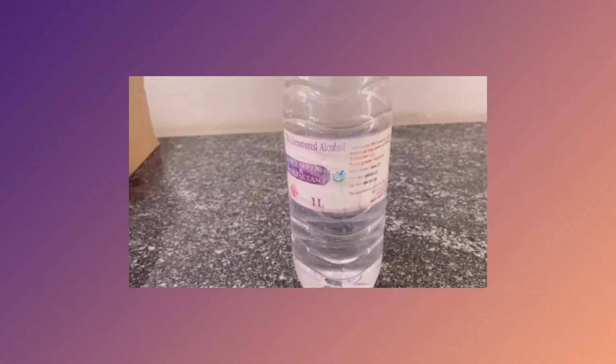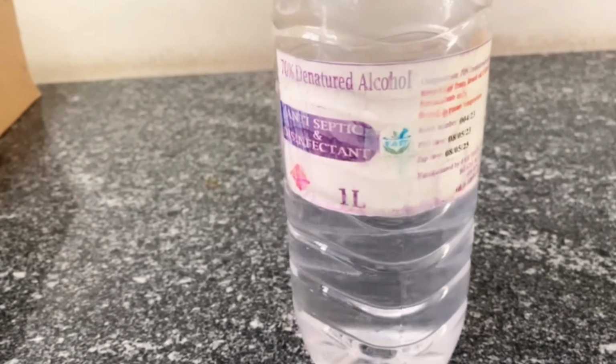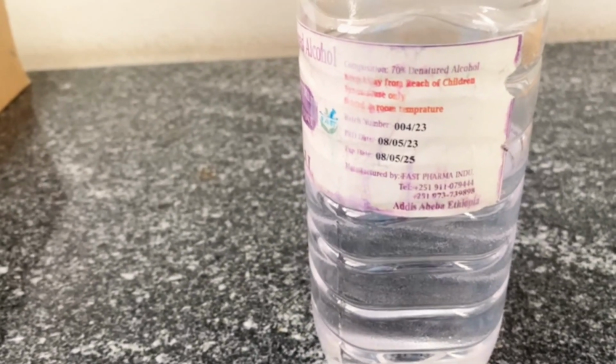preparation. Denatured alcohol, which is ethanol mixed with chemicals to make it undrinkable, is widely used as a solvent and cleaner in various chemical reactions.